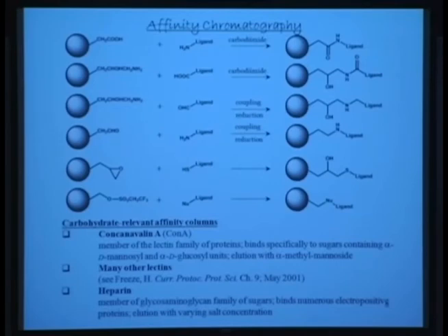You can engineer a hydrazine as Kubi presented, and you can couple the neutral carbohydrate with a carboxylic acid containing ligand, or for amines, for example glucosamines or galactosamines, you can use it directly for coupling. Obviously, if you're using receptors, then for the most part they already have a nitrogen, so that's not a problem.